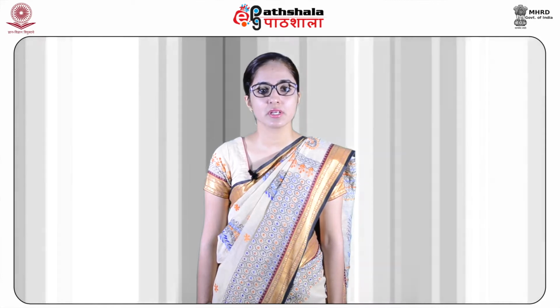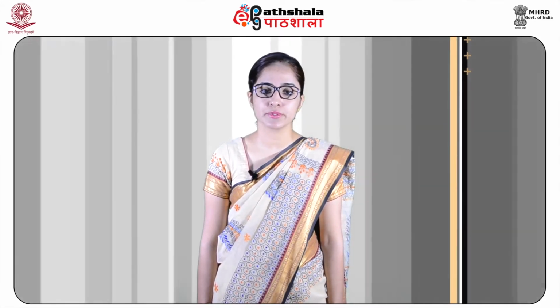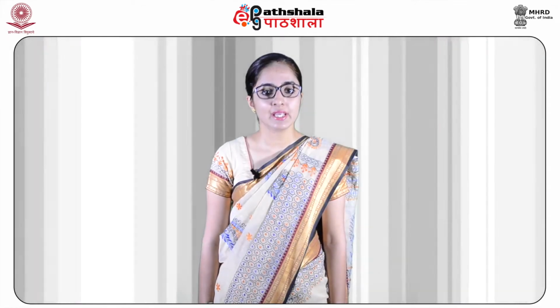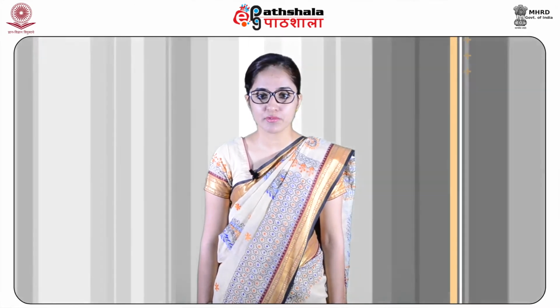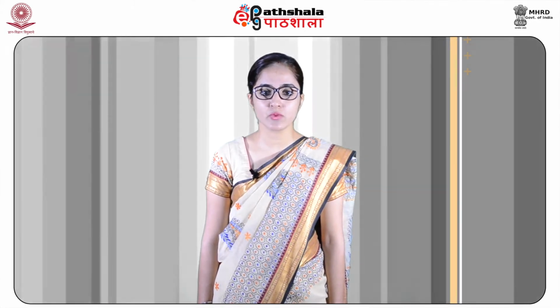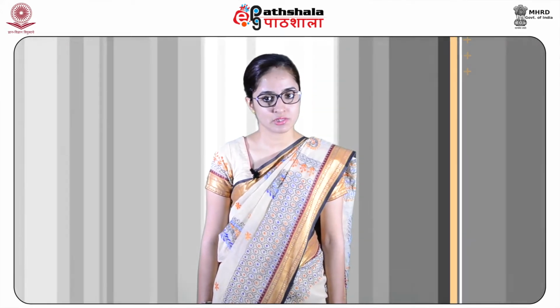And we will also discuss some of the problems related to the NMR structural elucidation. Today, NMR has become a sophisticated and powerful analytical tool that has found a variety of applications in many disciplines of scientific research, medicine and various industries. In the past 2 decades, with the development of new methodologies and instrumentation techniques, NMR has become one of the most powerful and versatile spectroscopic techniques for the analysis of biomacromolecules such as proteins, nucleic acids, etc.